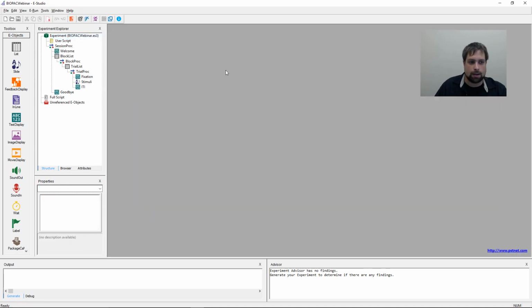Now, if you've been following along, you realize we're not sending signals yet. There's nothing in here that's actually sending signals to Biopac, and that's kind of the important part of this. So I'm doing that on purpose, just to do it separately to call out how these objects work together.